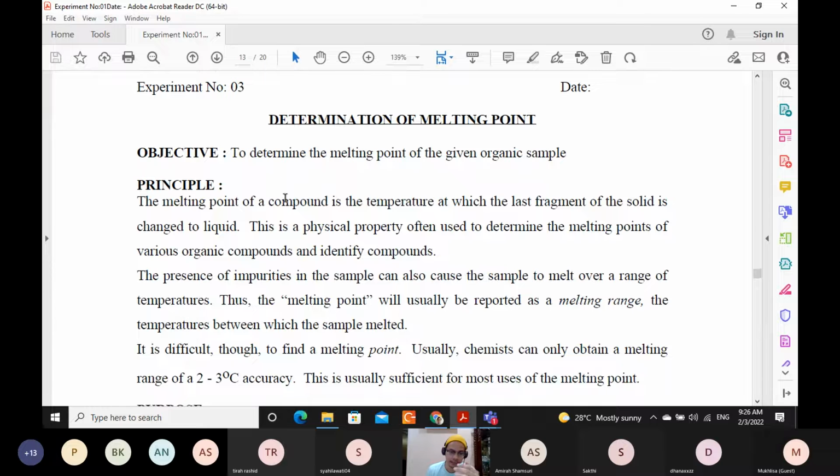Usually I will give several samples, glibenclamide tablet, chlorpheniramine, paracetamol. So I will give 3 and you have to determine the substances. I will give tablets X, Y and Z. In the end you have to identify. I will tell you paracetamol melting point 170, glibenclamide 150, chlorpheniramine 200. So I will give tablets X, Y and Z.